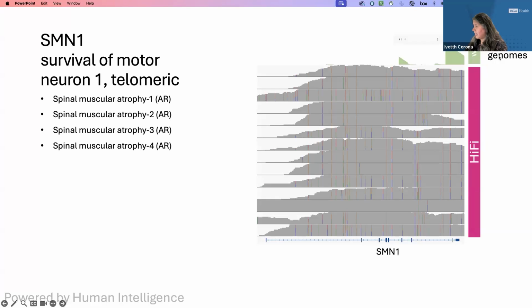And in gnomAD, the coverage in the genomes is really poor. So this track here should go all this way, but you only have coverage on this gene at the 3' end of the gene. And then you have these green areas that are covered, not in all the genomes that gnomAD has.